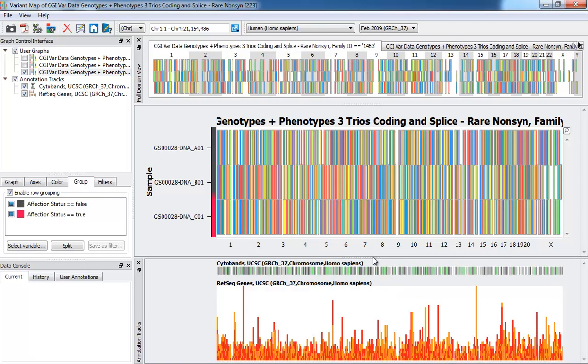As you can see, the PlotViewer is very powerful, and you can do many things, including adding additional plots, adding additional data to existing plots, zooming, scrolling, and adding public annotations to help enrich your visual experience.